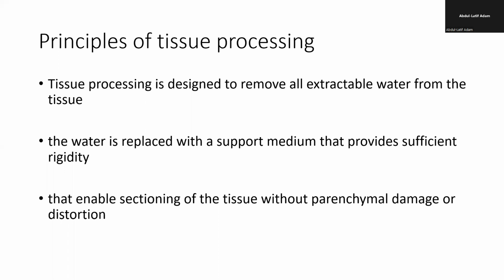Also, the tissue is processed to make it hard enough for easy sectioning. Because at the end of the, excuse me, let me take this call.